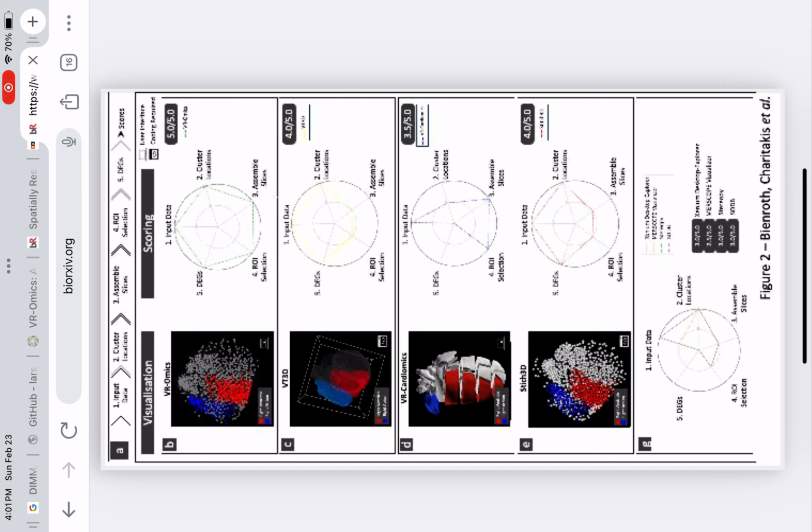Materials and methods. VR-Omics architecture. To deliver a seamless user experience, VR-Omics was conceived as a sophisticated end-to-end analysis tool, integrating two primary components via a user-friendly interface, supplementary Figure 3. The first component, the purpose-built automated workflow, focuses on the processing and mining of raw SRT data, supplementary Figure 3a, b. The second component, the visualizer, utilizes the processed data to facilitate advanced data visualization, equipped with multiple features for enhanced data interaction and exploration through a fully interactive interface, designed with intuitive data mining processes in mind, supplementary Figure 3c, d.